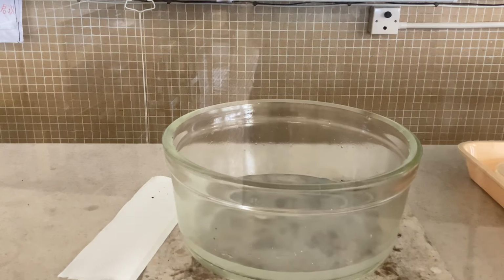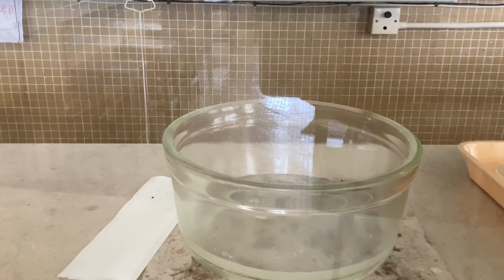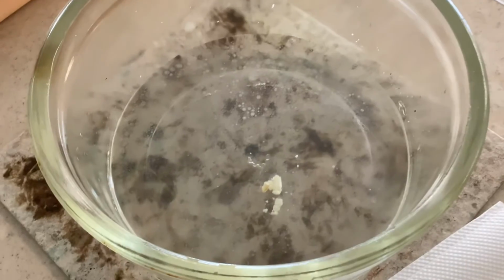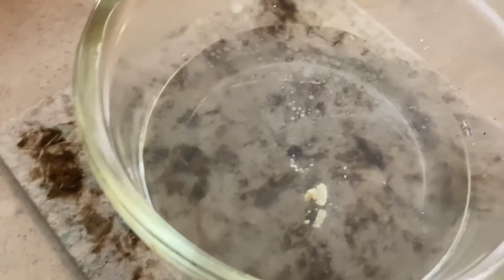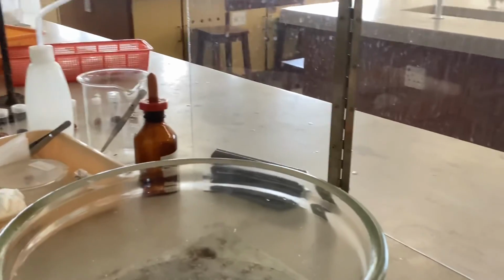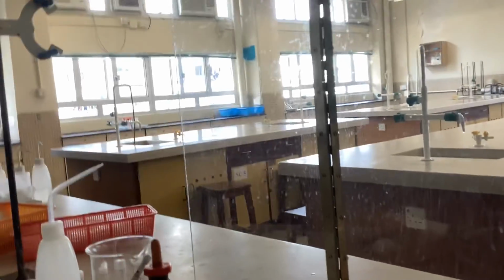And the next question is that you can see that the sodium metal or the potassium metal seems like they disappear, is it? If I have a closer look at the solution left behind. And here is the paraffin oil on the top. And do you think that this colorless liquid is still water?